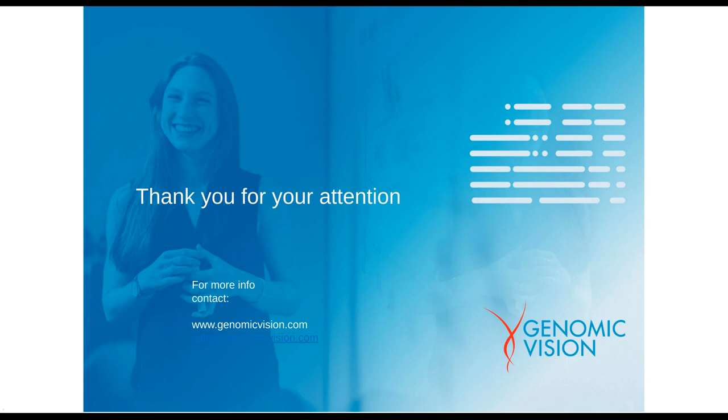Well, thank you. This is a very crucial question. Indeed, DNA replication is impacted by DNA damage, as we all know. Any DNA damage can cause a fork to fall or introduce some slowdown in the fork itself, which can then be visualized as an effect on the replication kinetics, as shown, by putting together the different parameters that we have. The fork speed tells us whether the fork is stalling or slowing down, and the inter-origin distance or inter-termination distance tells us whether dormant origins are fired in between two forks. This is a clear sign of DNA damage going on and of the effect of the DNA damage on the replication itself.